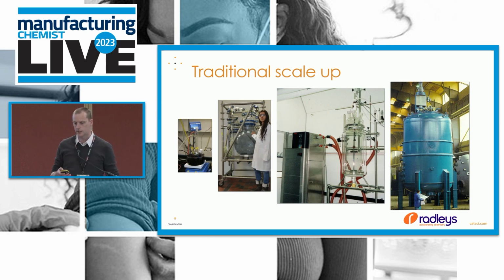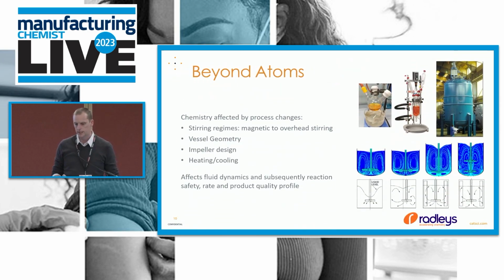So when you move between these different regimes, there are the same challenges, again, as Nick described, set me up very well. In the same way, instead of thinking about the gas phase and nebulizing solutions, now we're thinking about liquid phase, typically stirring, fluid dynamics, that sort of thing, as you move between these different zones.